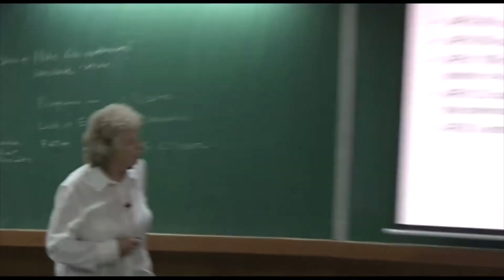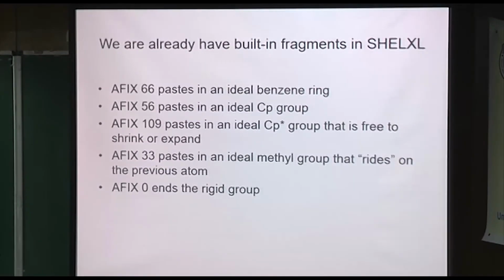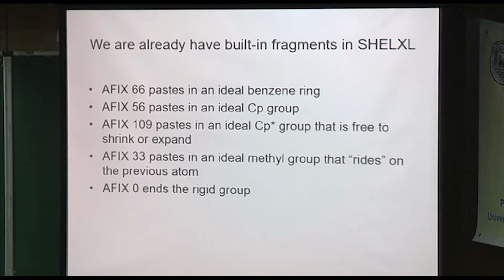Some of these rigid groups are actually built into the SHELX package. I don't know if you realize that the benzene molecule is built in. Have you ever tried to use that? It's AFIX 66, and it pastes in an ideal benzene ring. So it's built into the software. Also, AFIX 56 pastes in a Cp group, cyclopentadiene.